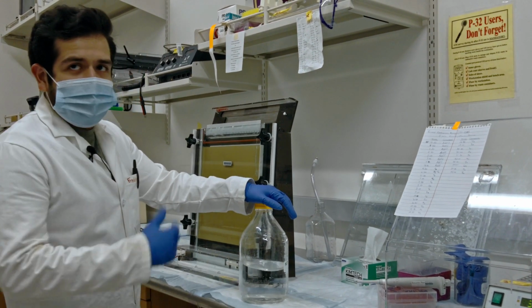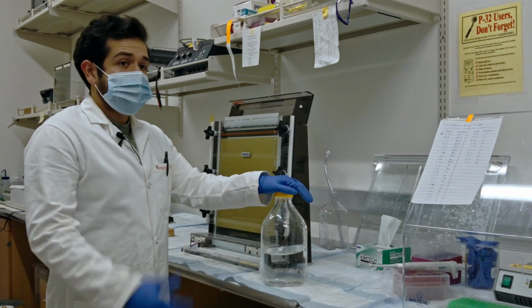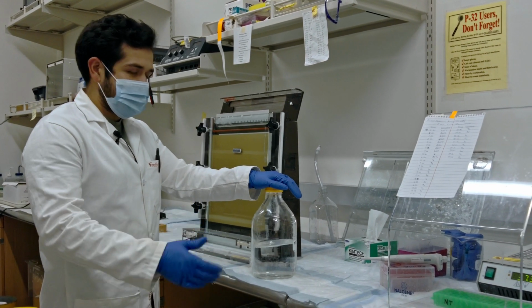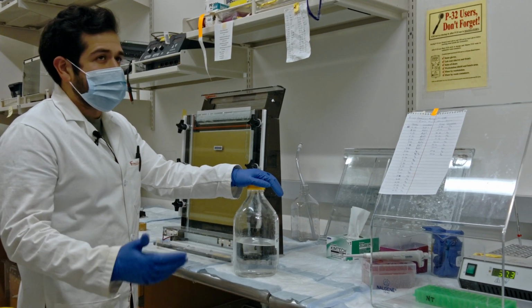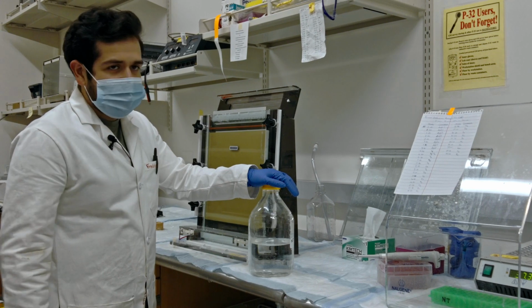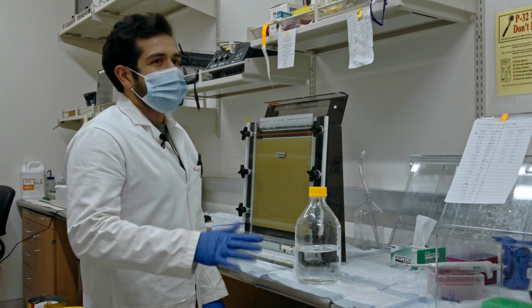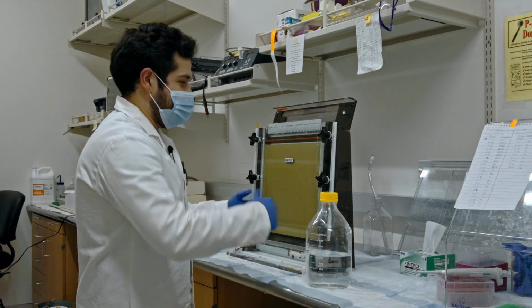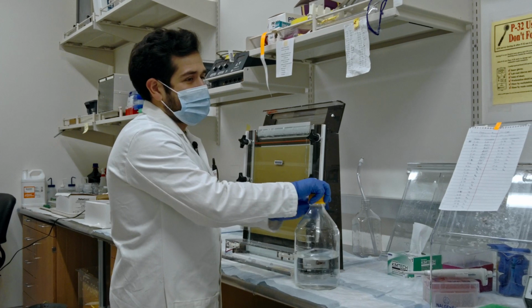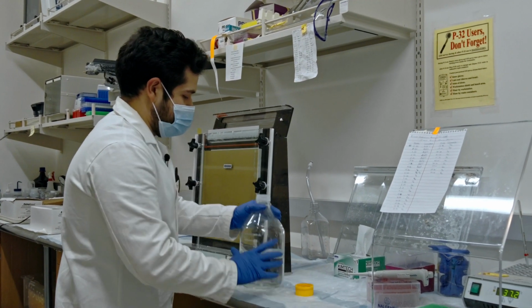Our running buffer is this 1X TBE. TBE standing for Tris, Borate, and EDTA running buffer. This we usually make in the lab in a 10X concentration, so we just get a portion of it, let's say 100 mils, which will be diluted by 900 mils in order to get a 1X TBE. This instrument requires about 1 liter max, and so here I have a little over 1 liter just to make sure that if I need any or if I spill some, there's still enough to run the experiment. So we're going to pour it at the top.